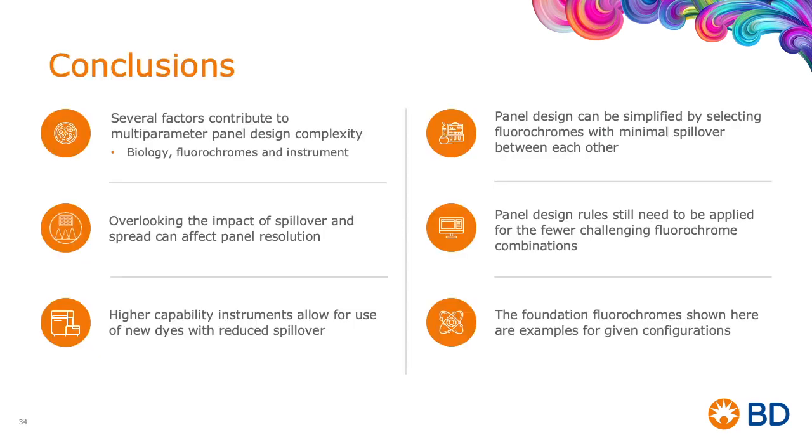So just to conclude the webinar, what we have discussed is that at the high level, we have acknowledged there are several factors that contribute to the complexity of multi-color, multi-parameter panel design. There's the biology, the fluorochromes, the instrument.